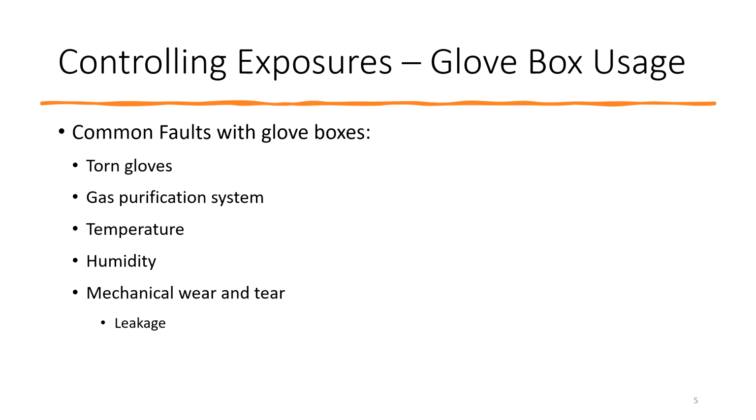You don't want to do an experiment with something that's not set 100% to the way it's supposed to be, have the experiment work, and then when you go to transfer this experiment, now it doesn't work in the atmosphere in which it's supposed to go. So we always want to use it exactly the way it's going to be used, to mimic that process. Make sure we're really controlling it. We're doing things on a small scale before we look at doing things on a big scale. Some things will always stay at a small scale, like radioactive isotopes for medical things.